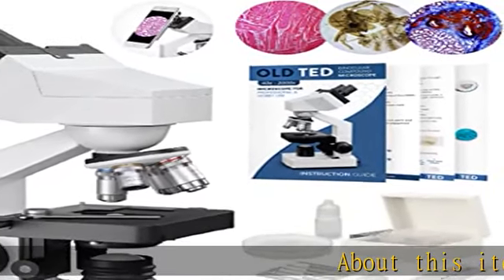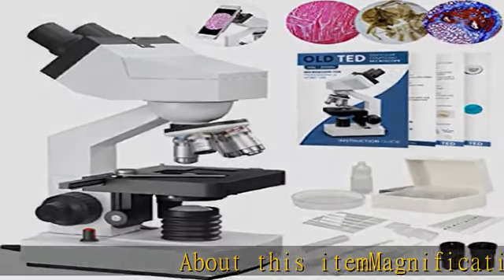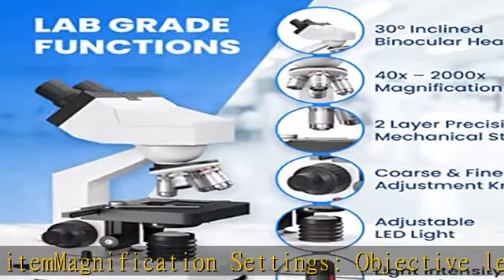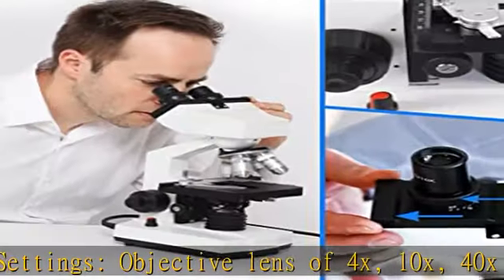About this item — magnification settings: objective lens of 4x, 10x, 40x, and 100x, and IPS lens of 10x and 20x, ensures high quality magnification.